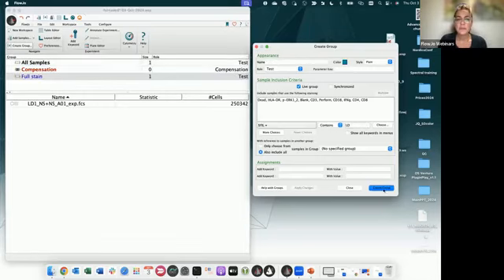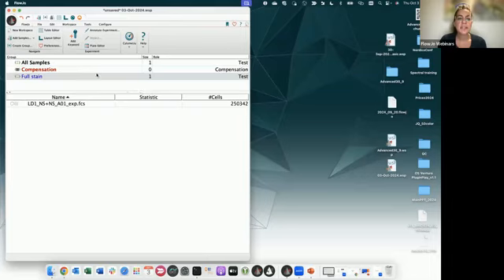So if I now create the group and close, you see that automatically in this group, the sample that includes LD in the name has been loaded. And this is what you want to have when you create a template. Okay, so naming a file is extremely important. Name it correctly and use names that can actually help you in your analysis, not only knowing what is what, but also to streamline your analysis in case you're creating groups, keywords, templates, and so on.